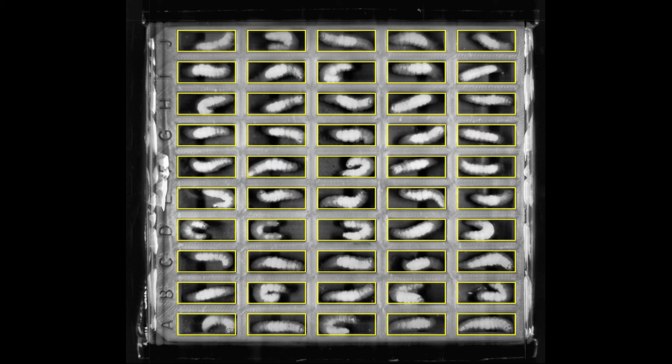Biosystems Technology are developing software to automatically analyse your images. Here we can see on the bright field image that the software has detected the plates and each individual well. This is then used to analyse your bioluminescence image.